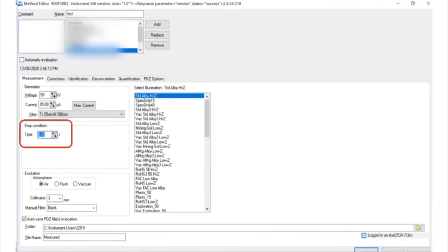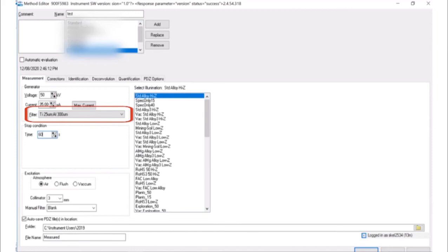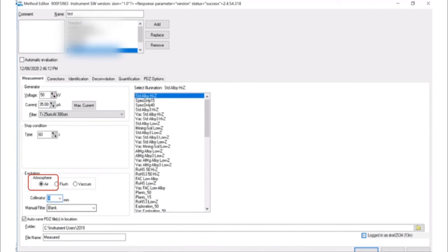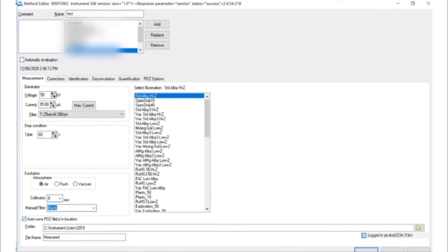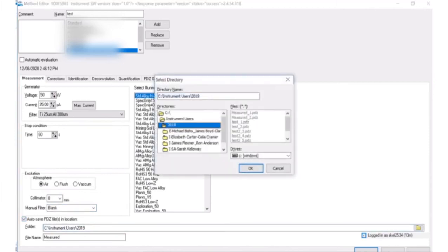If you are using a set time, change the value to the desired time. Select the filter being used. All analyses should take place in air as the atmosphere. Select a folder to auto save data if needed. The file names are auto incremented, so no data will be overwritten.